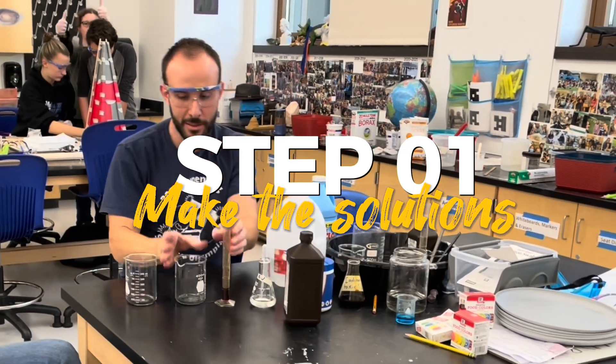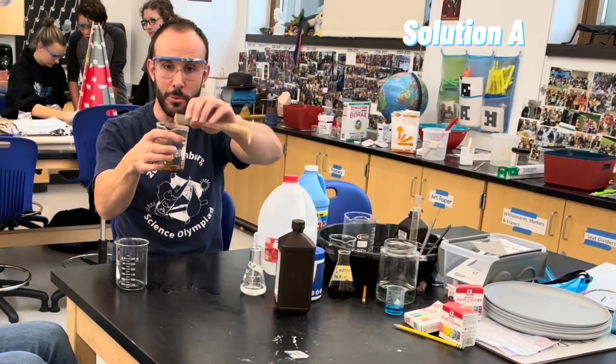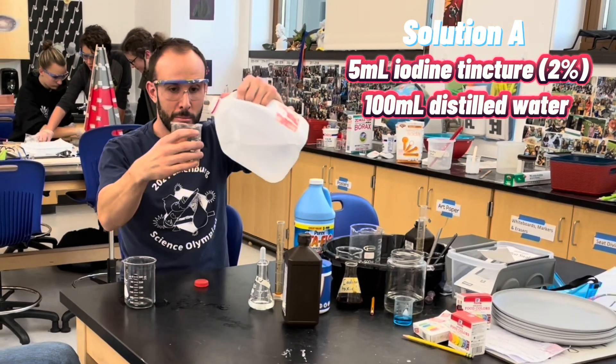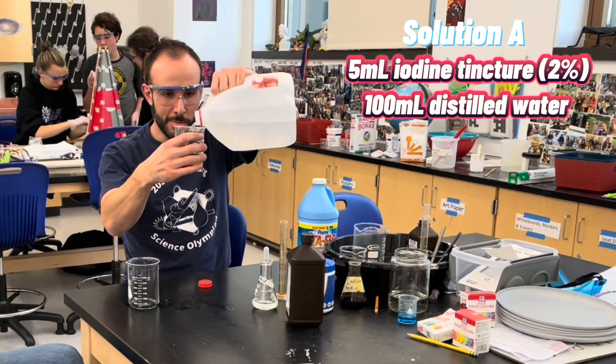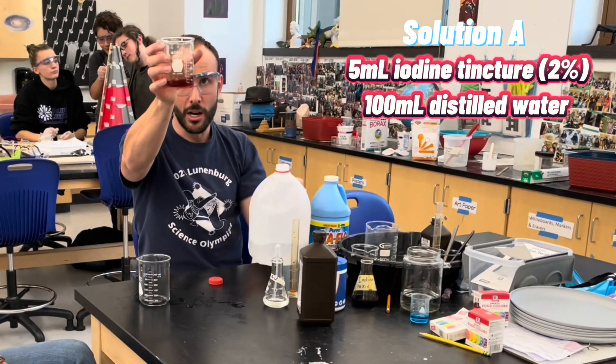So step one, we've got to make the first solution. I take the iodine — I've got 5 milliliters — and I put it into a beaker. Now I'm going to add in some distilled water, because the chlorine in tap water messes with the reaction, so you want to use distilled. I'm going to fill it up to 100 milliliters.